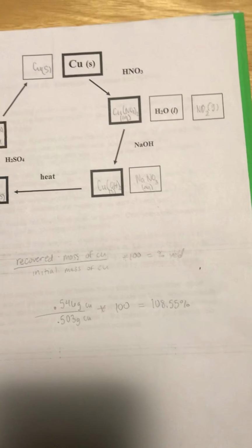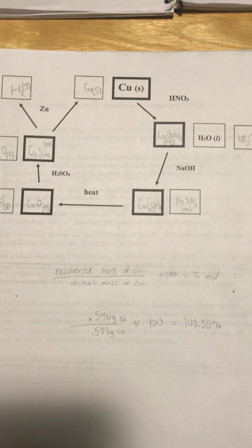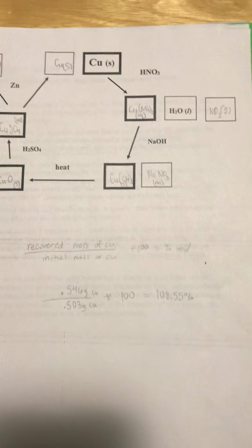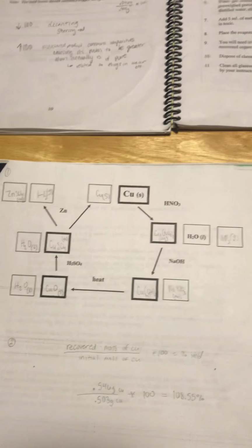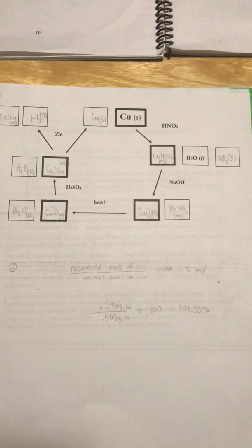So basically creating not a perfect solid. And then experimental errors that result in under 100 could be substances left on the stirring rod when we were stirring our solution and precipitate, or when we decanted, some of the solid being mixed within the solution that was decanted off. So things like that, and that's what we did in our experiment.